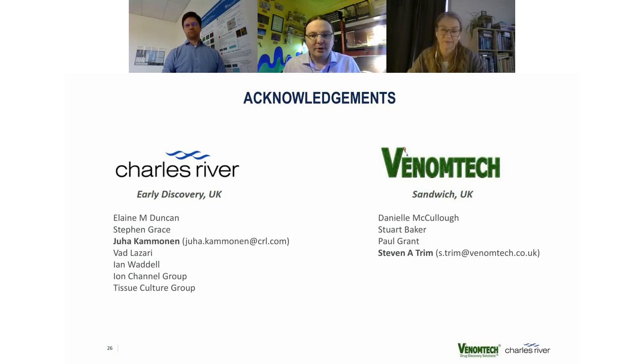So I wouldn't be surprised if new binding sites, new interaction mechanisms of action are discovered as we start to screen more and more venoms for these sorts of actions. We've also got the interesting convergent evolution. Juha mentioned ATX2, which is a cysteine knot peptide from sea anemones that has evolved to work on sodium channels to discoordinate prey, basically, or also potentially cause pain. So I think as we start looking deeper with better tools, we will start finding more and uncovering these new binding sites we hopefully can then use therapeutically.